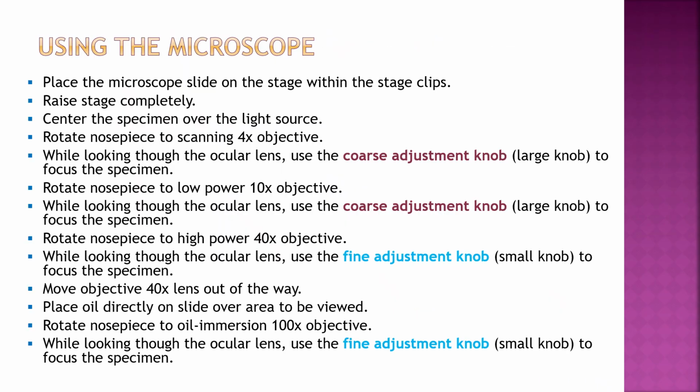So how do we use a microscope? Again, you're in a digital lab, so you're not going to be doing this, and you may have used microscopes in a previous course that you took, but you certainly will see them out in labs if you work in a doctor's office. There will be a microscope there that you can do some simple lab work with. And then, of course, if you were to work in a hospital lab, you would use them all the time.